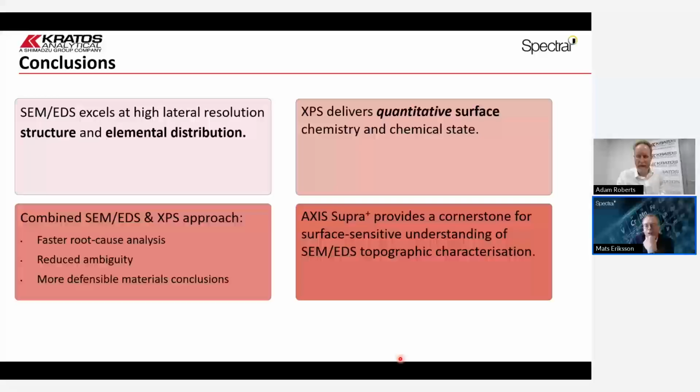So maybe it's a good time also for adding some Q&A things that we have. We actually have really good timing, because the sample owner from this Oslo sample, Wallace from the Department of Chemistry, is online. This is great. Thanks, Wallace, for joining in. And he said, "It's my sample." Actually it just has about 1 atomic layer of rhodium, so my estimate of 2 nanometers was far above. So we're almost seeing a single atomic layer of rhodium on those nanoparticles. Really cool, I think. Thanks for pitching in with that.